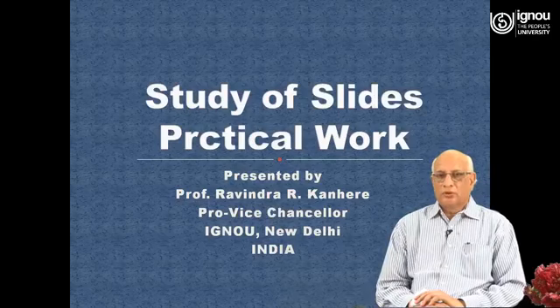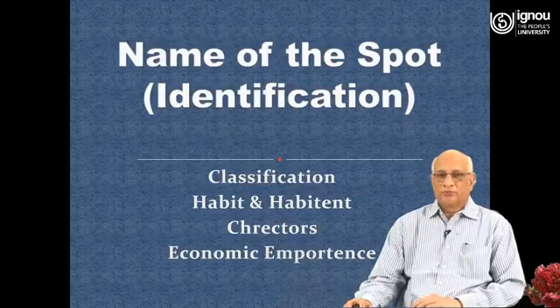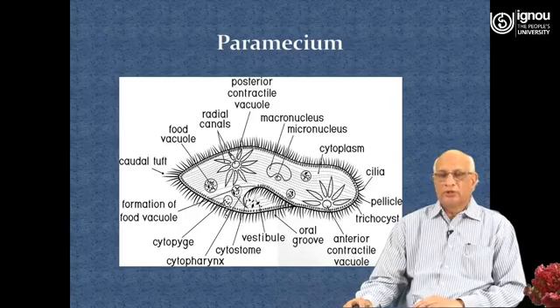So in this short span of time, a student can write the comments only when he knows too much about the specimen. So today we will study some of the slides, and from the protozoans we will study the first slide, that is Paramecium. After studying the slide of Paramecium, I will describe how to write the comments on it.